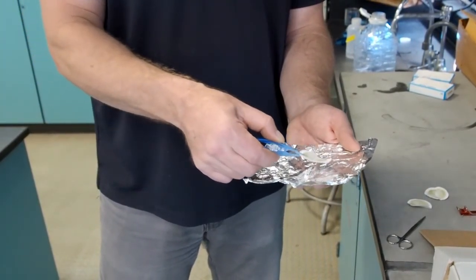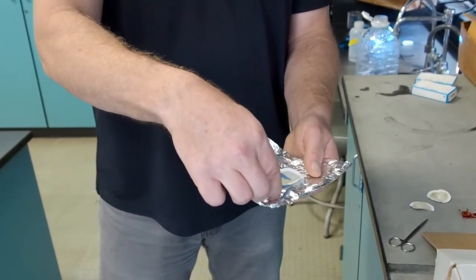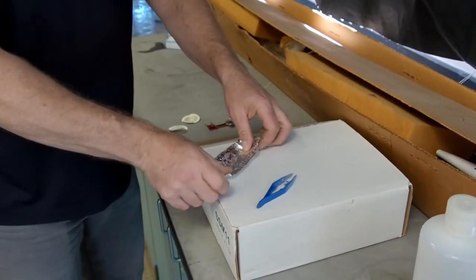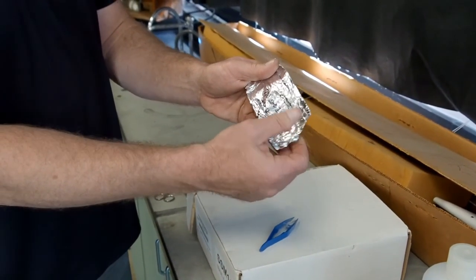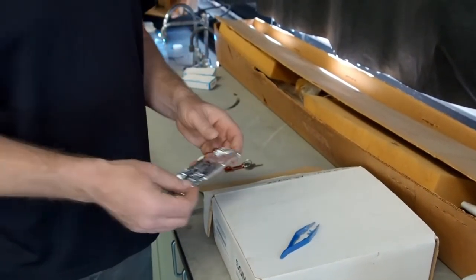So what we do is we put these in aluminum foil, we fold them over, and then we seal them up like this, put a label on the aluminum foil so we make sure we know where this is collected from and when, and then store these for up to a month in the freezer until they're ready to be processed.